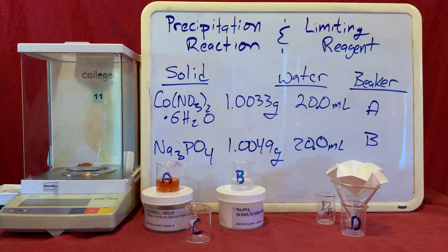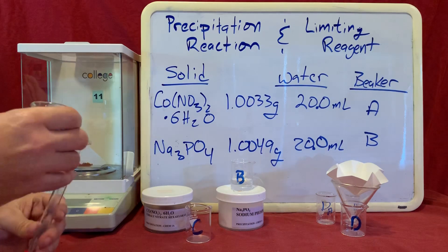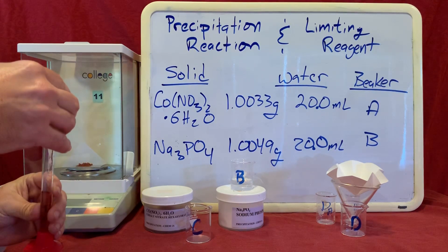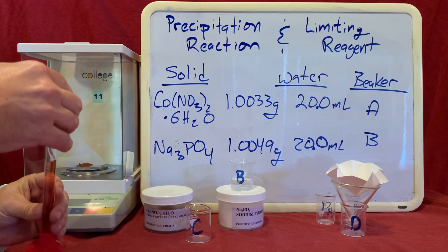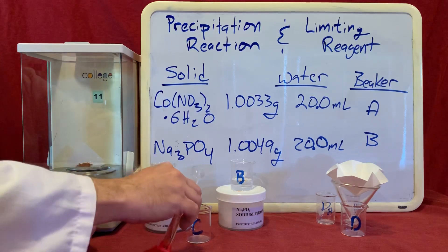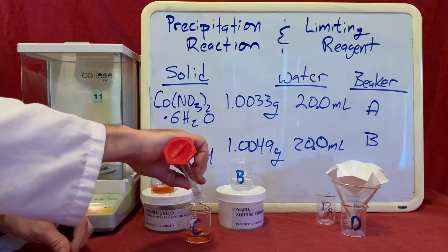In the next portion of this lab, we're going to mix approximately half of solutions A and B into beaker C. Now I want to make sure I don't overdo this, so while I could estimate it, I'm going to actually measure out 10 milliliters of solution A and pour that into beaker C.